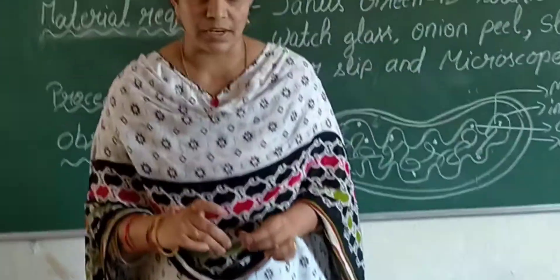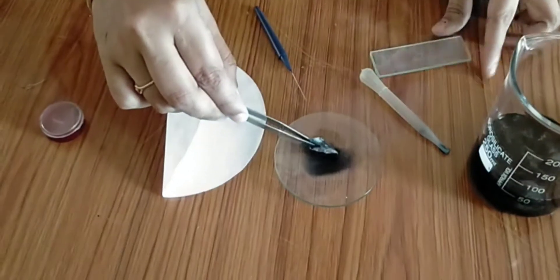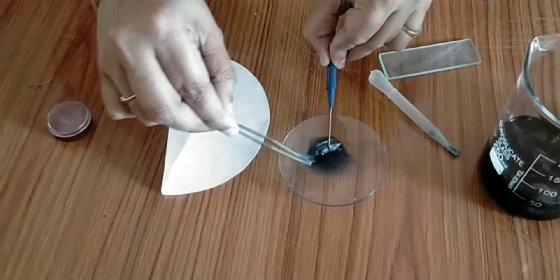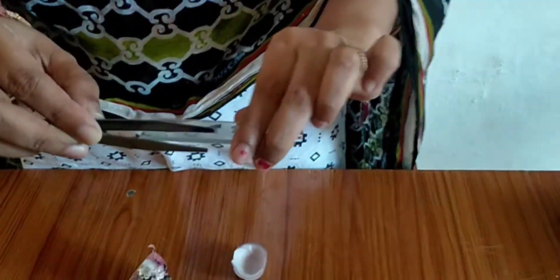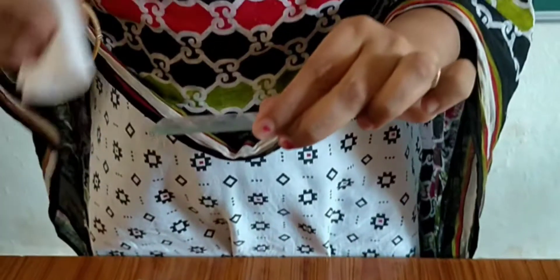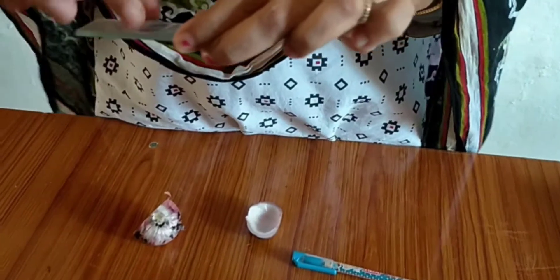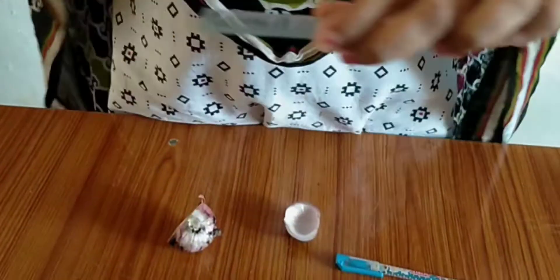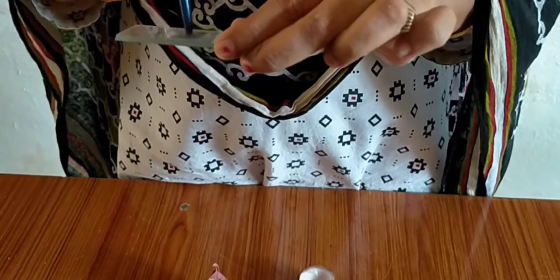After that, take this onion peel. Take a small piece of onion peel and mount it on a slide. If there is excess reagent, remove it with the blotting paper. Place a cover slip over the onion peel and press it with the blunt end of a needle to remove air bubbles from the slide.